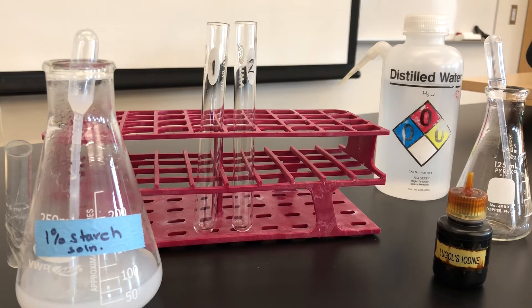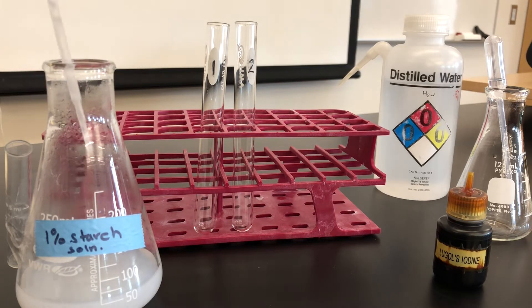To test for starch, we do an iodine test. I've labeled two test tubes, number 1 and number 2, following the guidelines in the lab manual. To test tube number 1, I'm going to add 1 ml of starch.